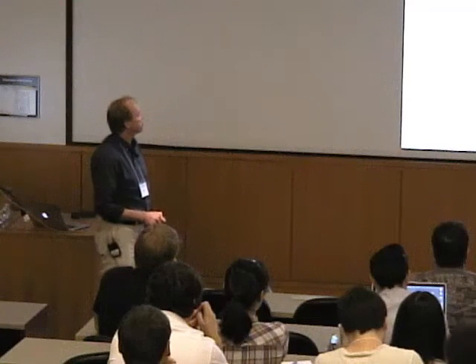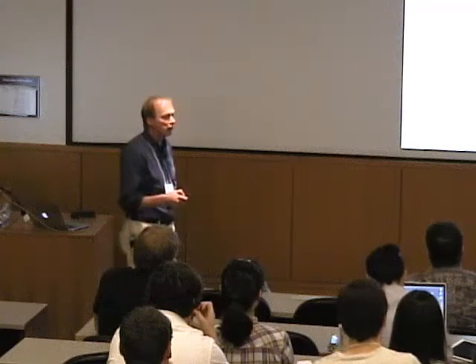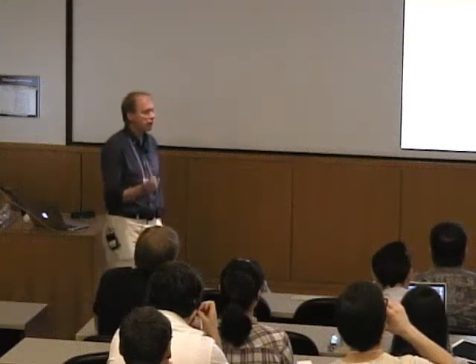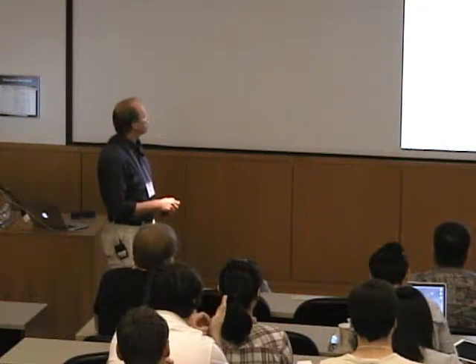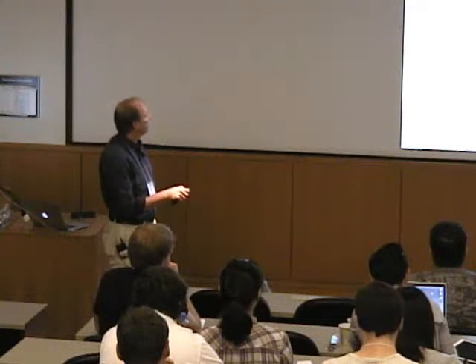Okay, so in EPR, of course, we're measuring the paramagnetism in a system. If we look at an electron, of course, it has spin angular momentum. So what we have is a charge, and it has some kind of angular motion. In a hand-waving way, we can represent that as a sphere with some kind of spinning motion. The upshot is that there is this angular momentum. We're moving the charges in a circular way, and the angular momentum here is represented by this vector.